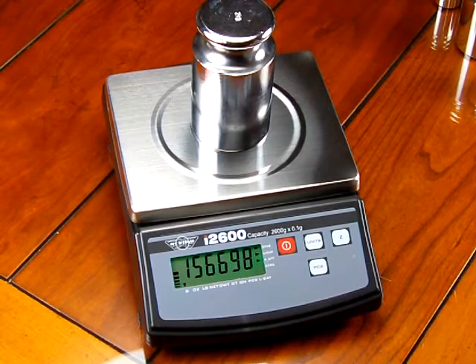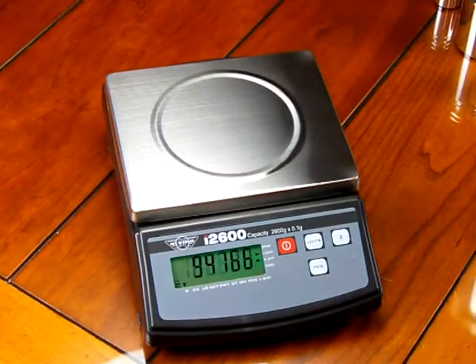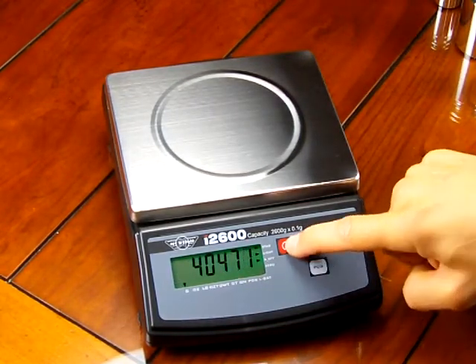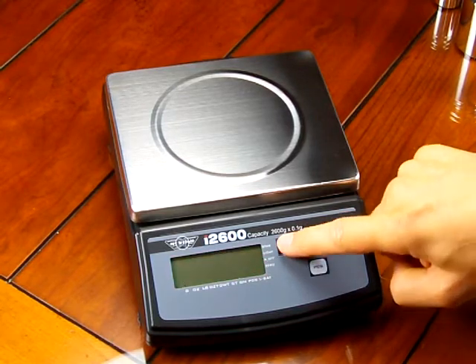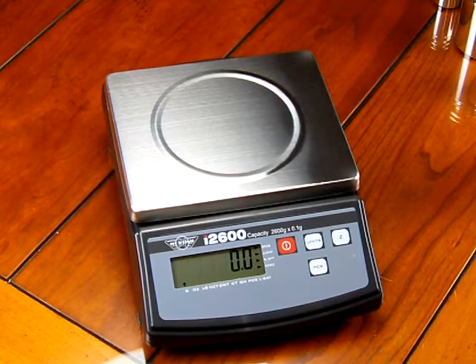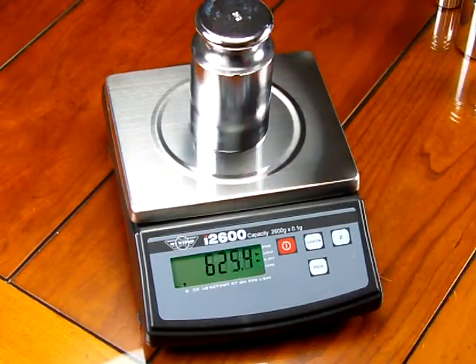To complete calibration, all we need to do now is take the calibration weight off, turn the scale off, then power the scale back up. The scale will go through the countdown mode, testing all the electronics, and then it goes to 00.